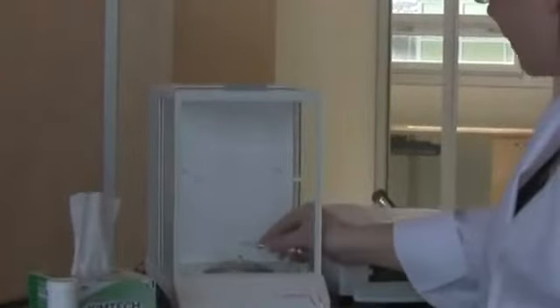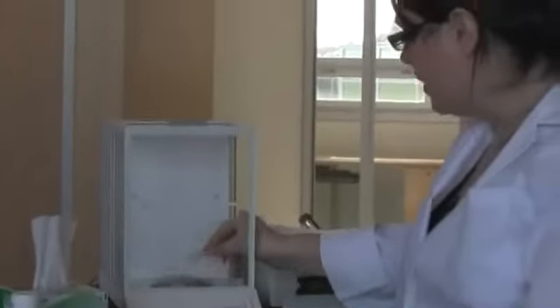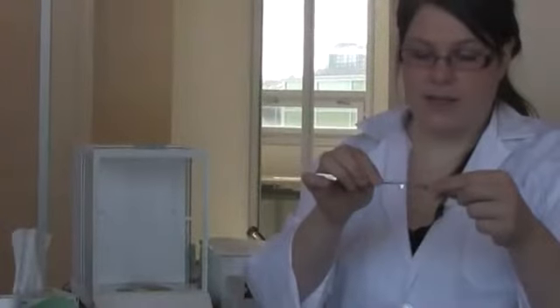Using your two tweezers, remove the capsule from the microbalance, pinching the top closed. Now we fold down the top of the tin capsule like it was a paper bag, folding it down twice. And then finally flattening it from top to bottom.